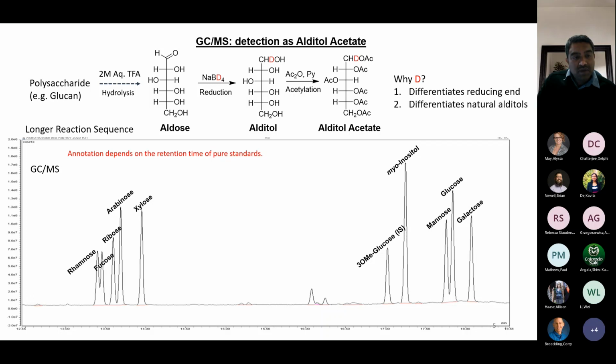You see the bunch of pentoses, arabinose, xylose, ribose, and you see mannose, glucose, galactose, all each sugar, each peak, one sugar, one peak. We also have myoinositol. Just to note that myoinositol is not a sugar, but it has a sugar-like structure. And you may see that rhamnose and fucose are also coming along with the pentoses, although they are hexoses, because they are deoxyhexoses, and one hydroxy group at 6 position is not there. So they behave more towards pentoses on GCMS.